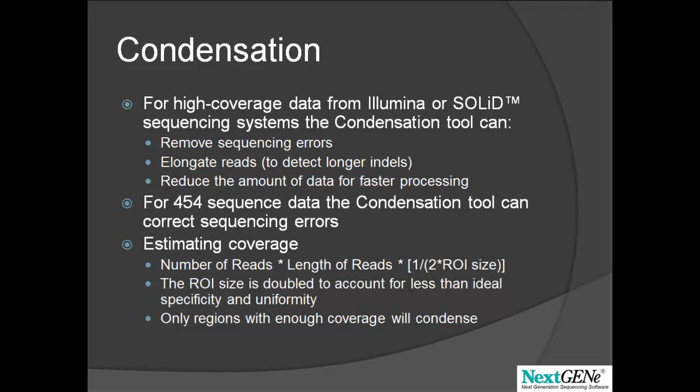Even if the estimated coverage is very high, it is likely that some of the regions of interest will be missed due to low coverage because there is never perfect uniformity.